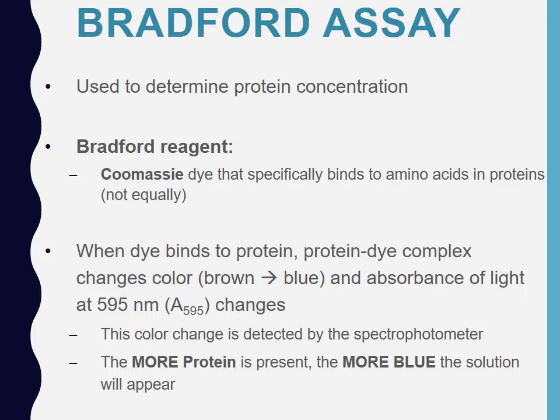It's very important in those experiments that you are adding the same amount of protein across your different samples. Recall, when discussing experimental design, you really only want to change one variable at a time, and you want everything else to be constant. Since you're usually looking for other readouts, it's important that your protein concentration is consistent across samples. And so the Bradford is helpful because it allows us to know what concentration my isolated sample is, and therefore how much do I have to load in every sample in order to have a consistent concentration.